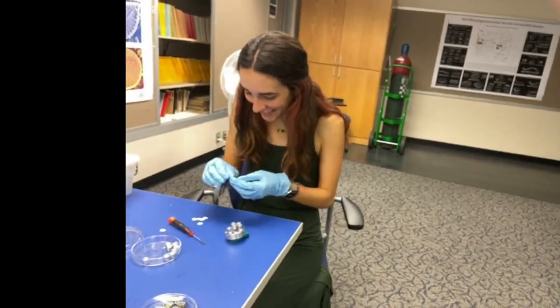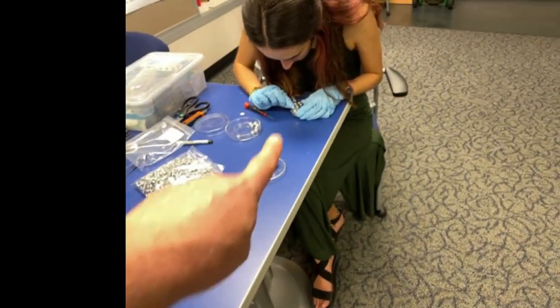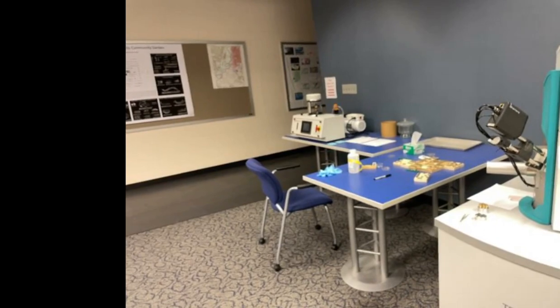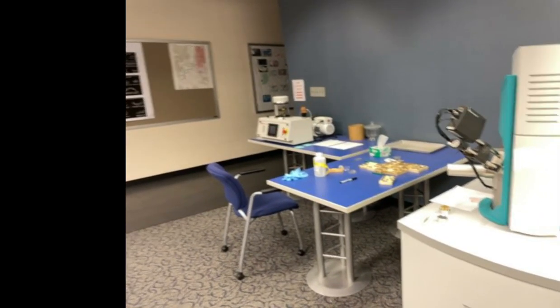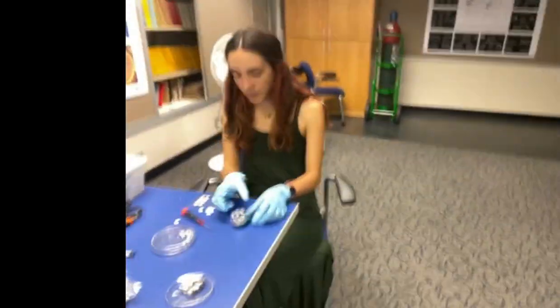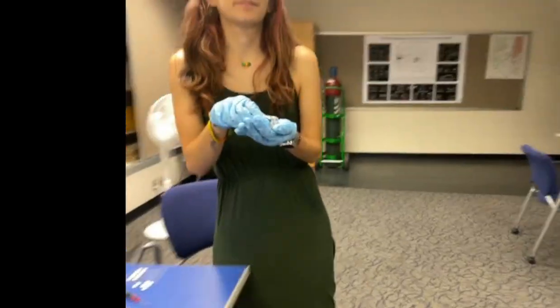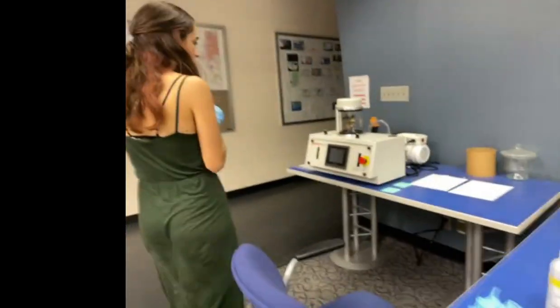Yes. And so we're going to take them from here, and once all 7 of them are prepped, we're going to take them over to the sputter coater, and then we'll go through the sputter coating process, and then we'll put them in the SEM. And we'll put them into the computer so that you can actually see stuff. Good? Yes. Perfect. Onward.